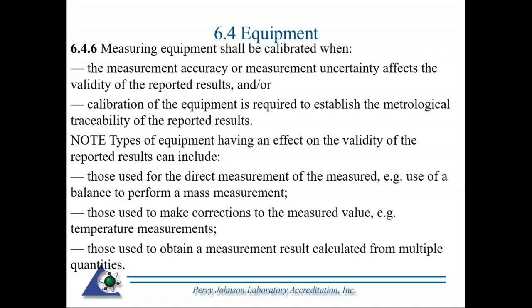And if you're stating your measurements are traceable, then of course the equipment associated with that. And traceability is sometimes a term that gets tossed around loosely. PL2 is our document at Perry Johnson for our policy regarding traceability. And of course, if you're providing traceable measurements, you want to make sure that your equipment will be calibrated supporting your traceability. So what type of equipment are we talking about?